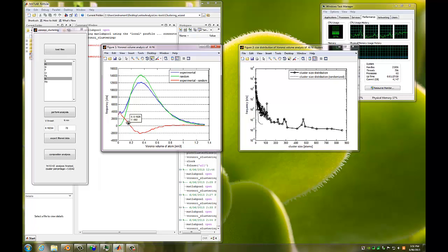You can see it's crossed it here. It's closer to 0.19, so we can actually change that to 0.19. But usually, if you've got a larger data set with better statistics, that's usually pretty spot on. Anyway, in this case, I'll just change it to show you where the value comes from.